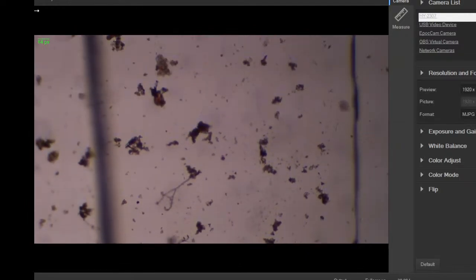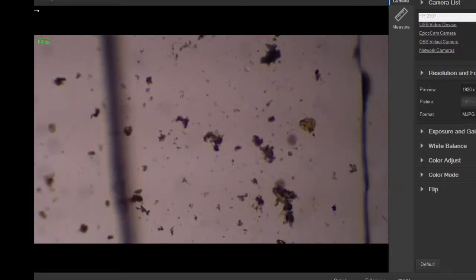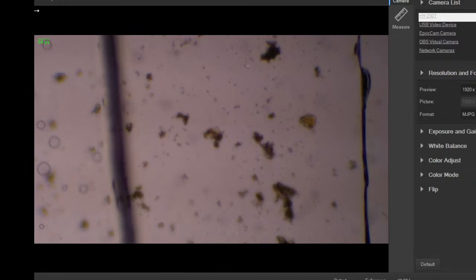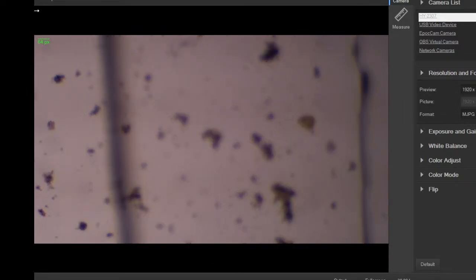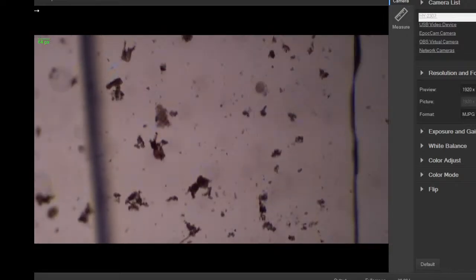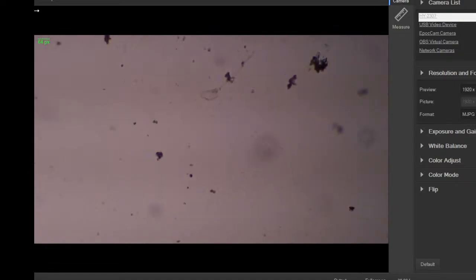And when they're not attached, they look like this. Keep changing focus on these guys here. So that's these guys swimming here, and there's another one up here, which is like that little Stylonychia guy, or one like that.